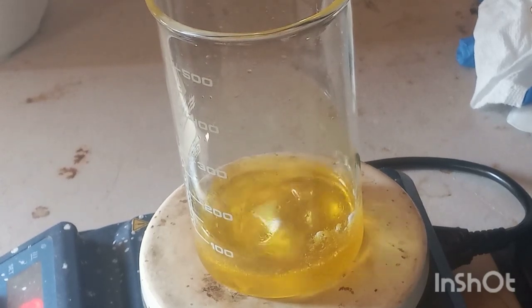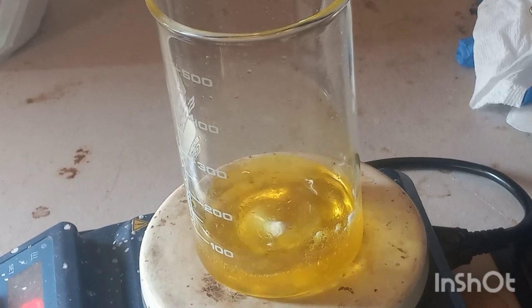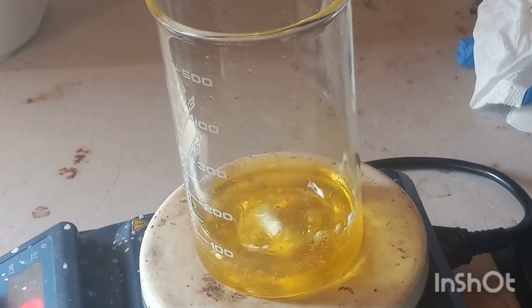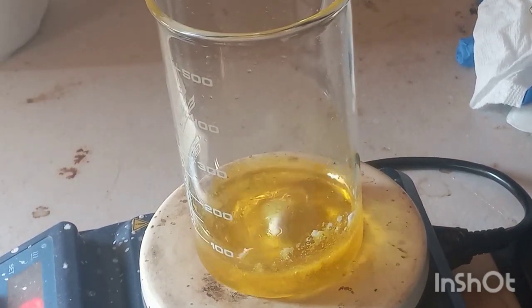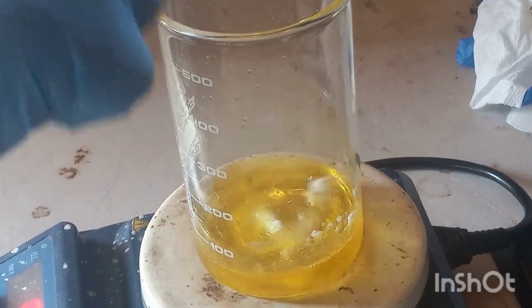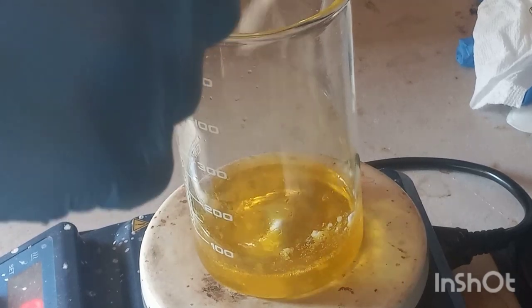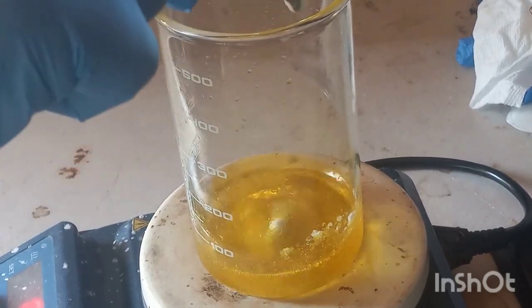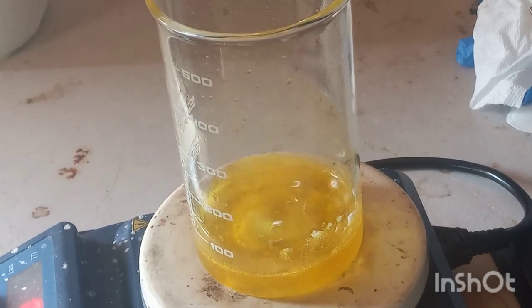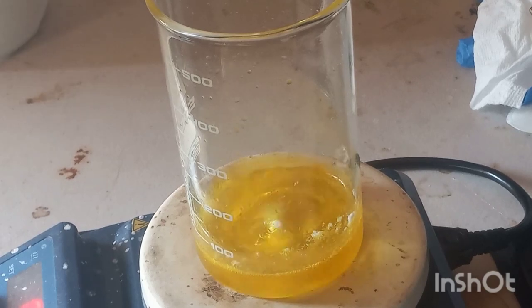Now we've got about 40 milliliters instead of 80 milliliters. You really don't need all that — I'm trying to conserve on my H₂SO₄ since it is 98% stuff. You basically add this; I don't believe there's any huge exotherm, but we're going to heat it to 70°C for four hours and it will all dissolve.